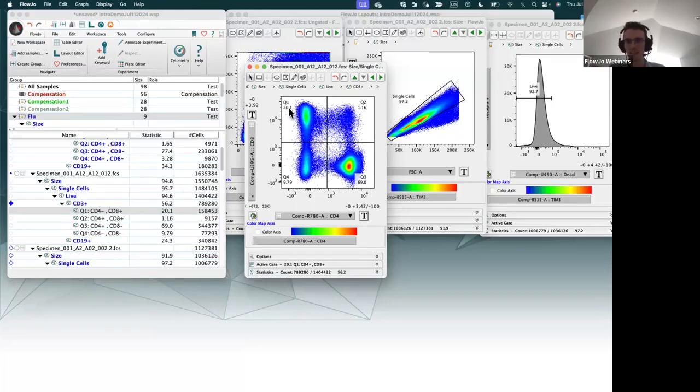But again, if I adjust this, you can see right now this is 20.1% of my cells. I move this down here, it's 20.3. So it's not really significantly changing what cells are being included in here when I move the gate, unless I get really high up into this yellow, then it's going to change it significantly. But yeah, I'm just setting it sort of midway between our positive and negative regions, trying to get the positive half of the cells and leaving out the negative side of the cells.